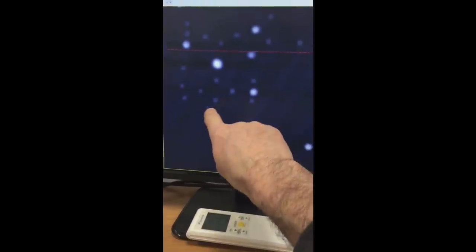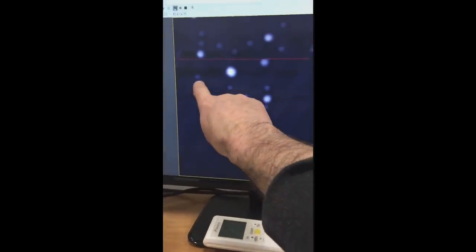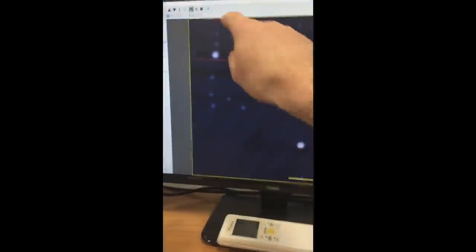So, of course, as soon as you left, it started to work incredibly well, almost as soon as you went out the door. Let me turn the camera view round so you can see what's going on. I've spent a few happy hours depositing atoms from the tip. All these features that are roughly the same size are individual, almost certainly gold atoms that come off the tip, but we've crashed the tip quite heavily into the gold sample, so the tip is covered with gold atoms.